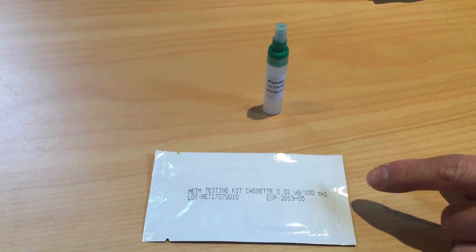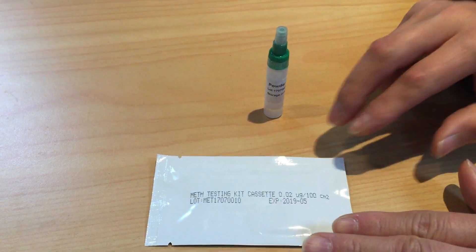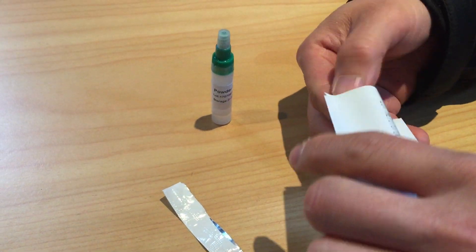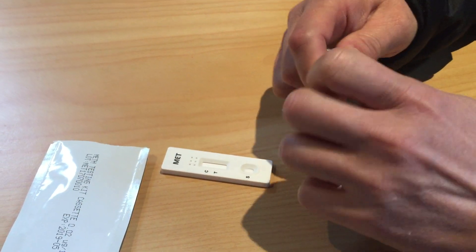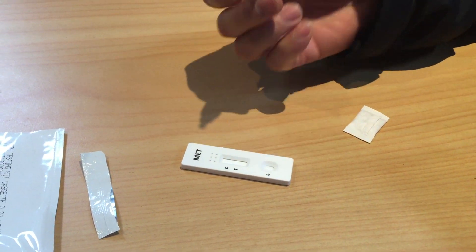What we're going to demonstrate here is basically what a negative result looks like. This is a non-contaminated sample, so we can see what a negative one looks like, because we do have some positive ones that we've already tested. We're going to test this one without any contamination just to show what it should look like.